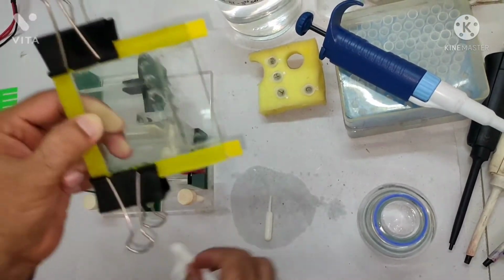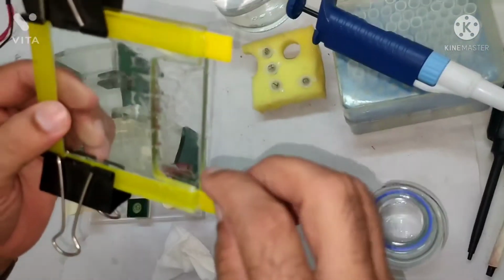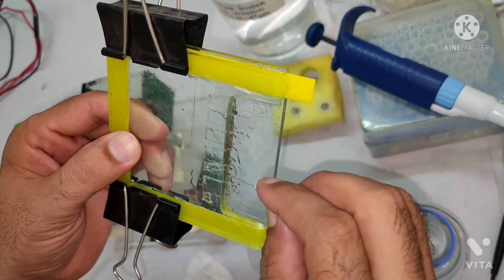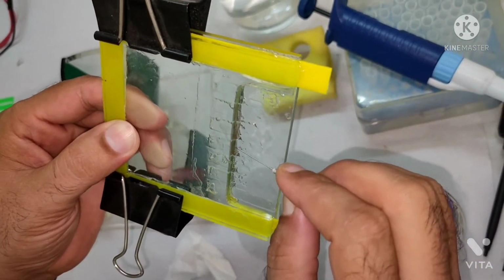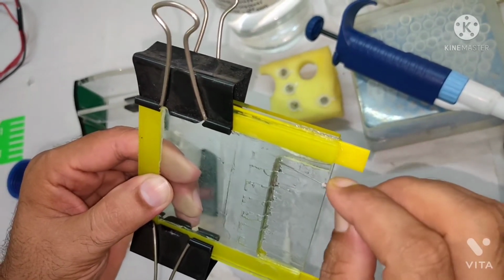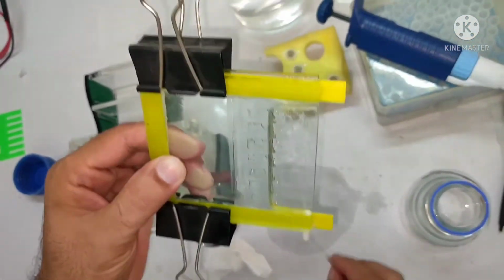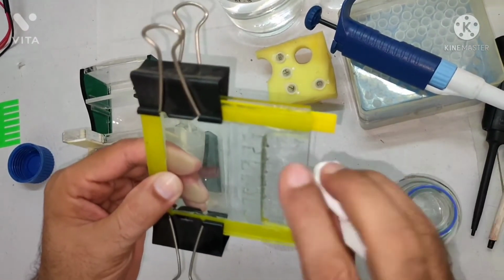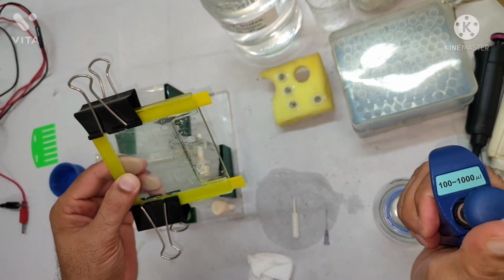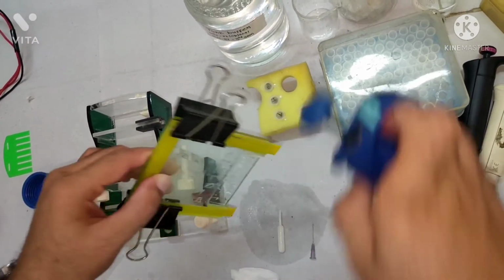And make sure that your well is very much clear. You can clean again. I can see it needs a bit more cleaning, because some of the, like this needle, this simple needle, you can clean if something is stuck into your well. See, okay, so nothing is there inside. Whatever you can see, this is just on the outside of the well, okay? So now this is clear, okay? You can wash it again if it requires. Okay, all right.